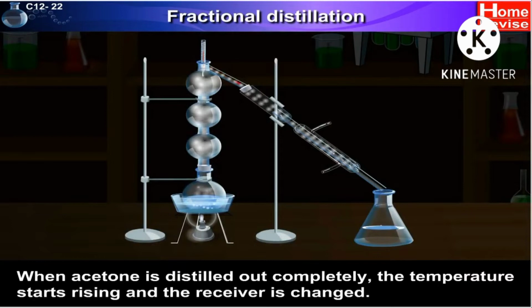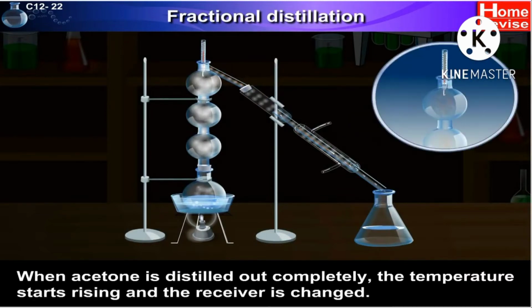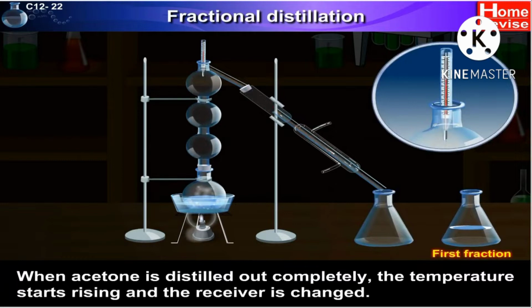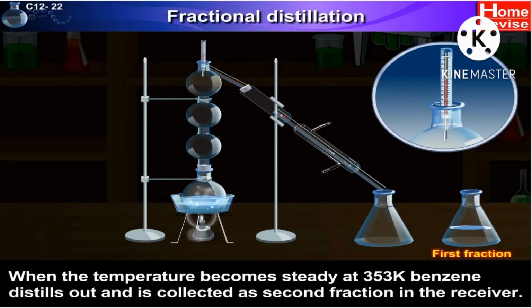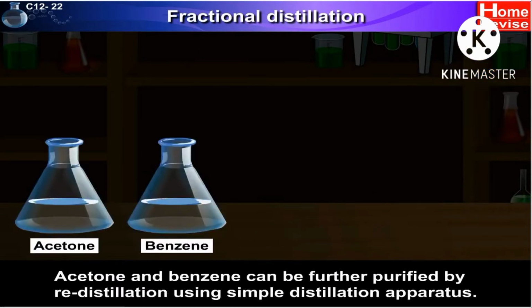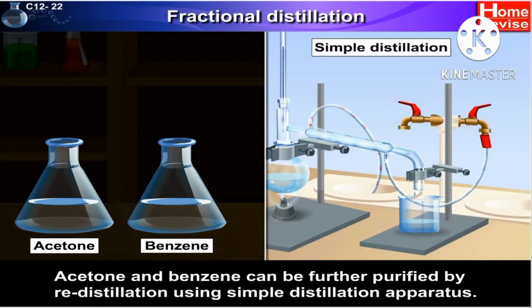When acetone is distilled out completely, the temperature starts rising, and the receiver is changed. When the temperature becomes steady at 353 Kelvin, benzene distills out and is collected as the second fraction in the receiver. Acetone and benzene can be further purified by redistillation using a simple distillation apparatus.